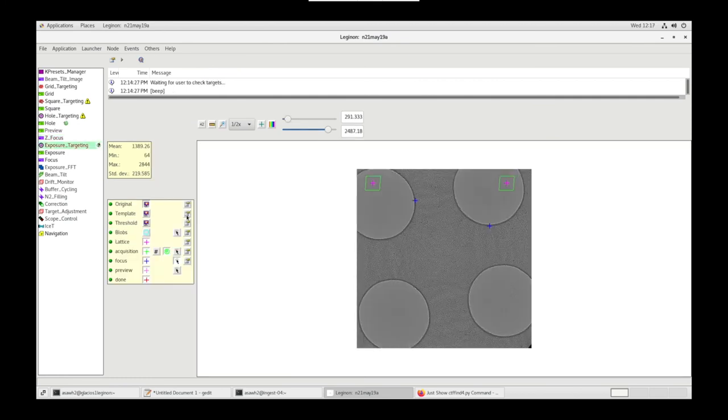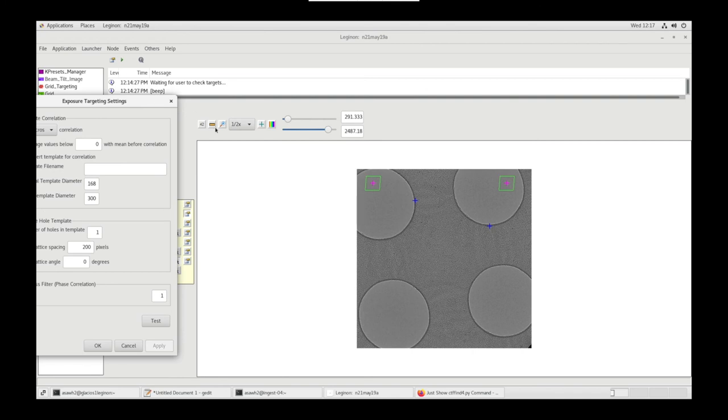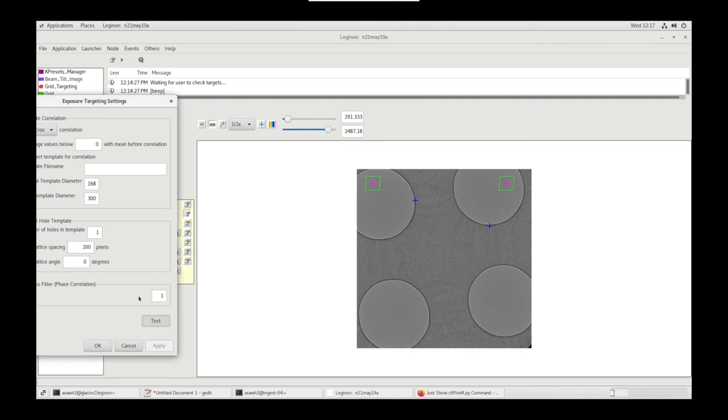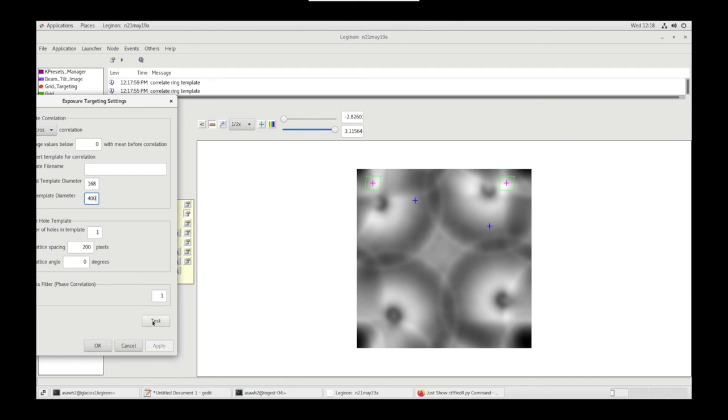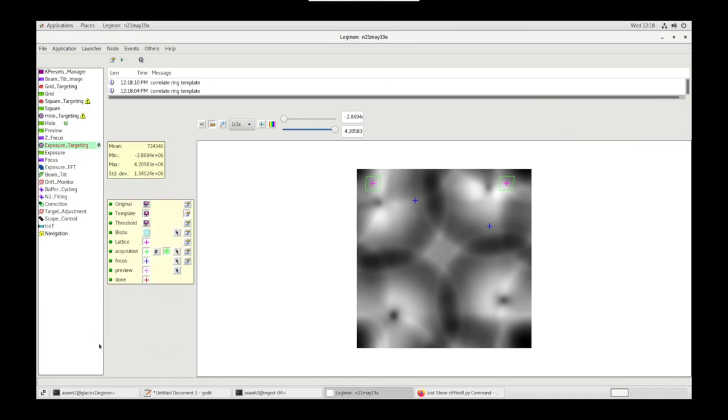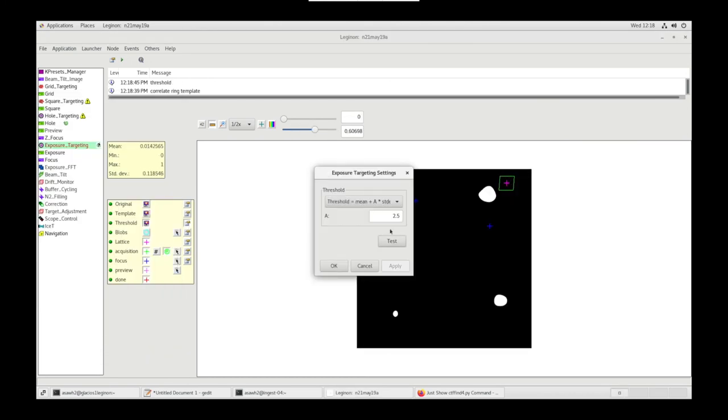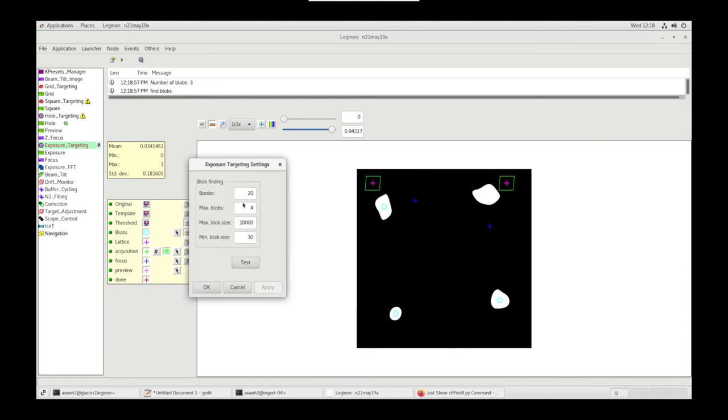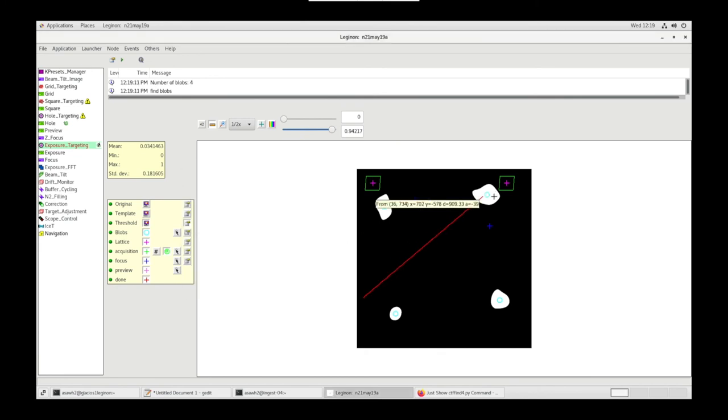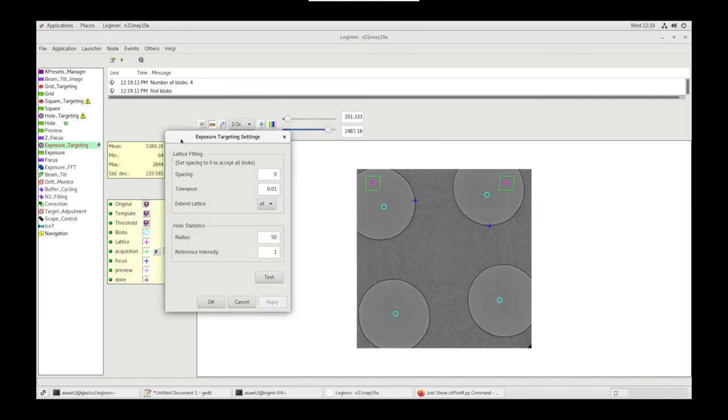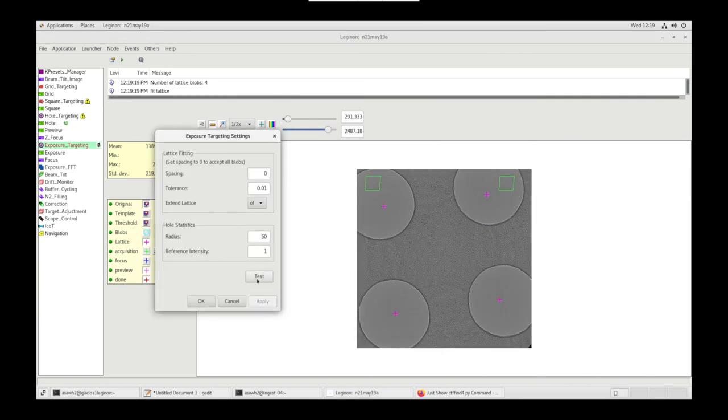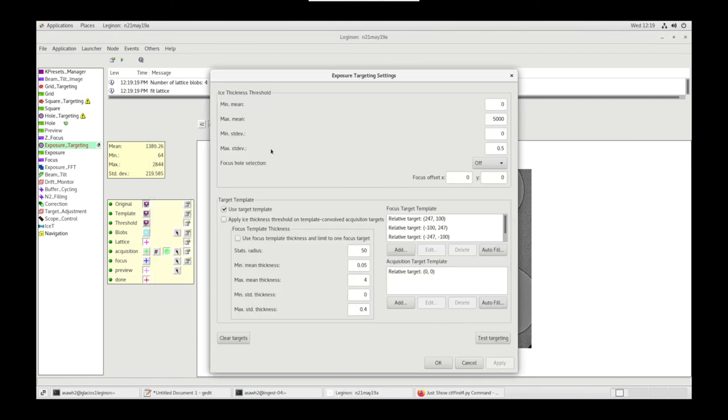Let's go to Exposure Targeting, Template Settings. Let's measure the diameter of the hole. Let's change our value in Template Diameter. We want that bright white peak in the center, so let's add diameter, keep testing. Let's do Threshold Settings, set it to 2. Blob Settings, test. We're missing the top right blobs, so let's increase our max blob size. There we go. Now let's go to Lattice Settings, Test. If you want to accept all blobs, set spacing to 0, Acquisition Settings.